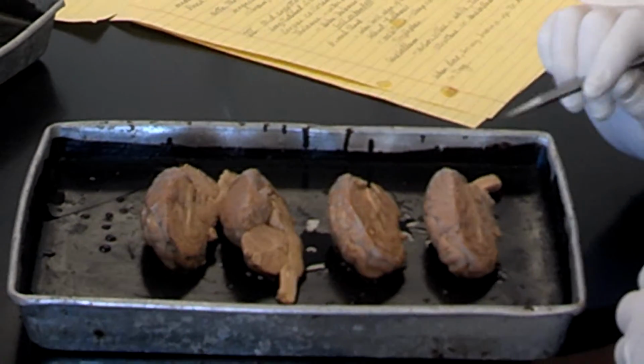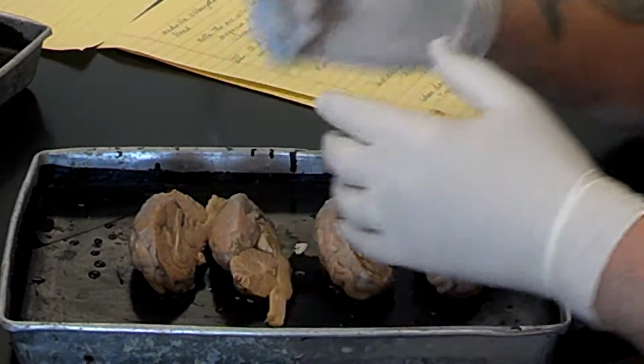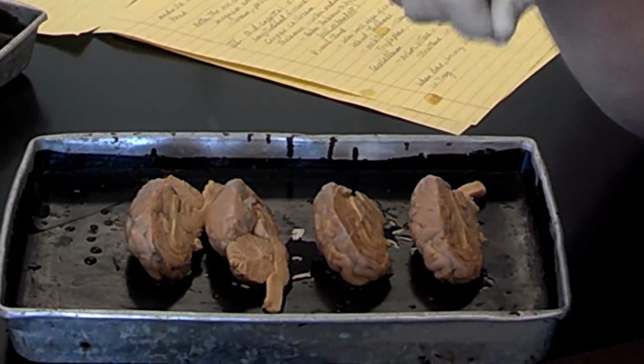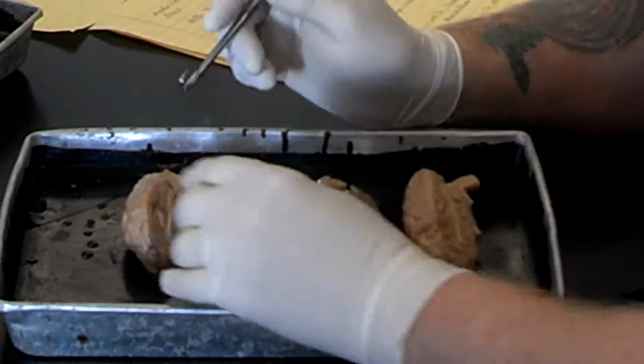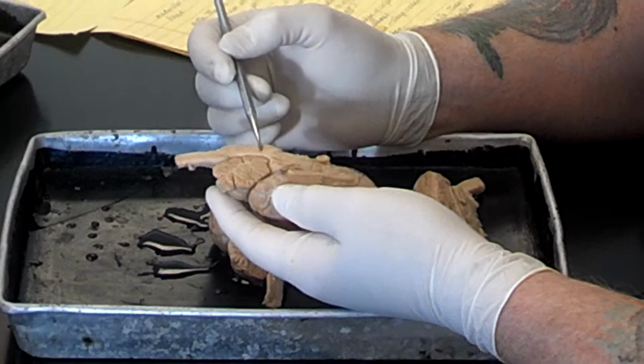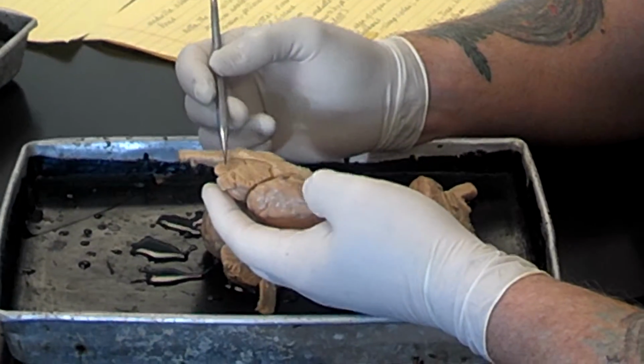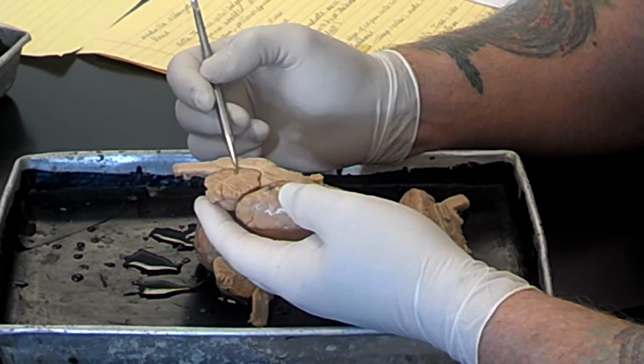of a sheep's brain. And so essentially we've gone down right through the longitudinal fissure and sliced it in half. Now, what you can see pretty clearly here is the medulla. Here's the pons, the little swelling right here. This is the cerebellum, okay?